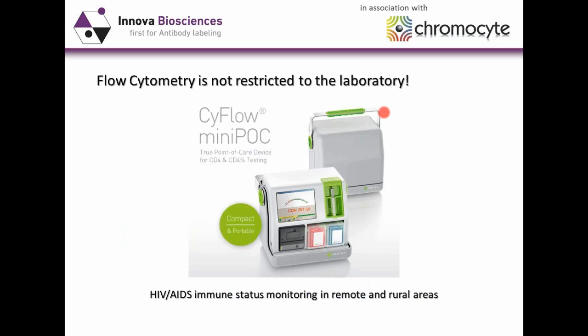And here we have an instrument which is produced by Partec, and this is really a POC, a point of care instrument, which allows HIV and AIDS immune status to be monitored in remote and rural areas by providing a basic CD4 positive T cell count. And this particular instrument is battery operated, and so this allows remote analysis to be undertaken.